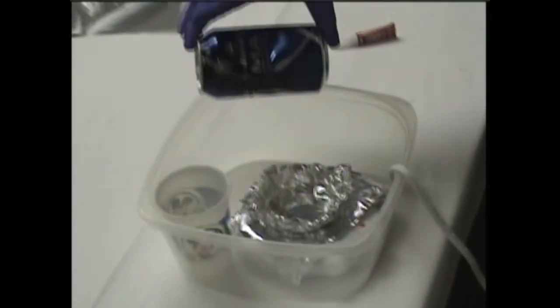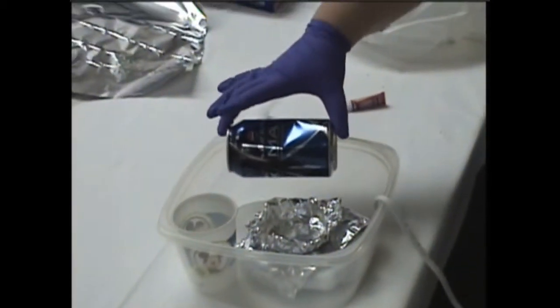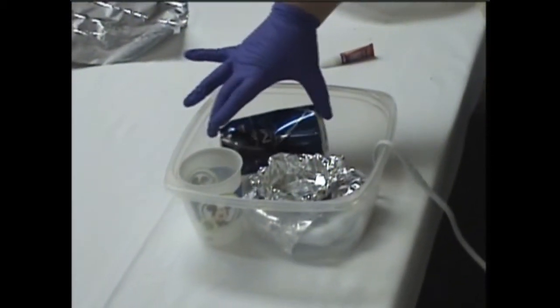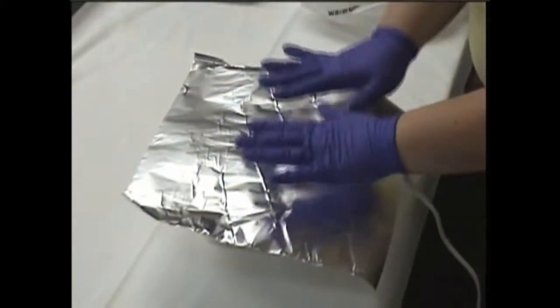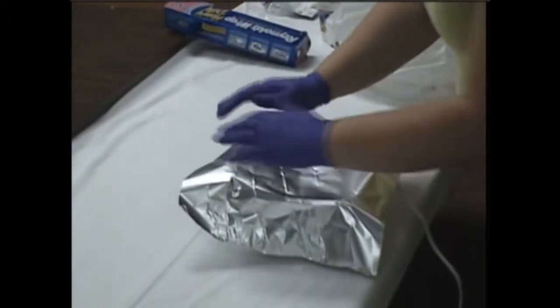Now we have the can that we are going to be fuming to look for fingerprints. You just place the can in the chamber and then cover the whole thing with some form of lid.